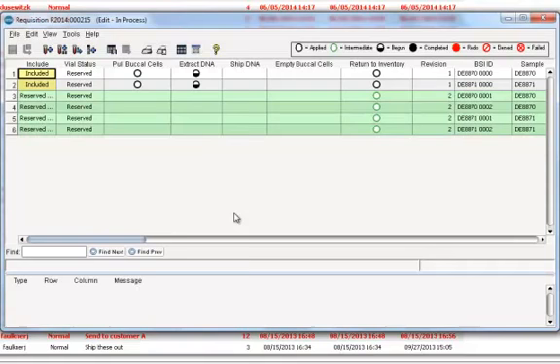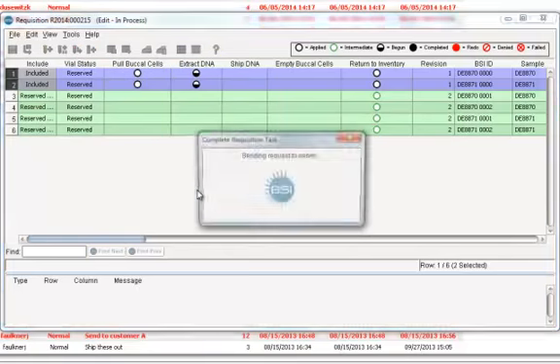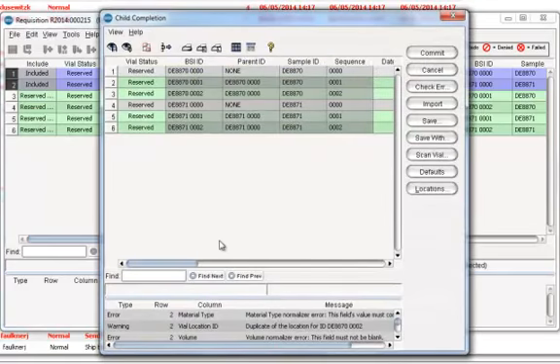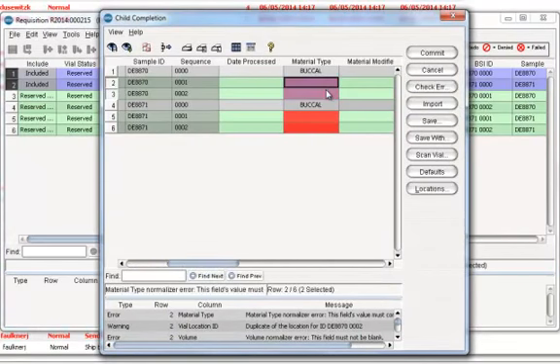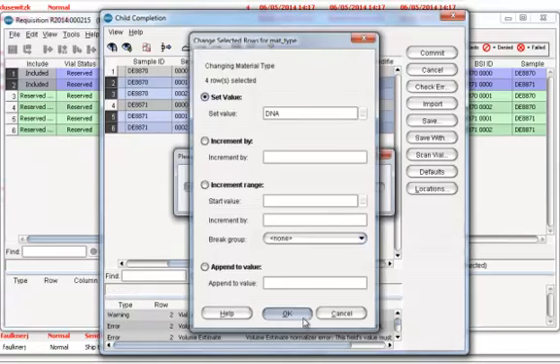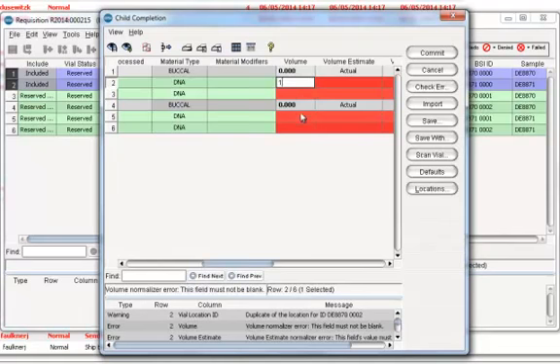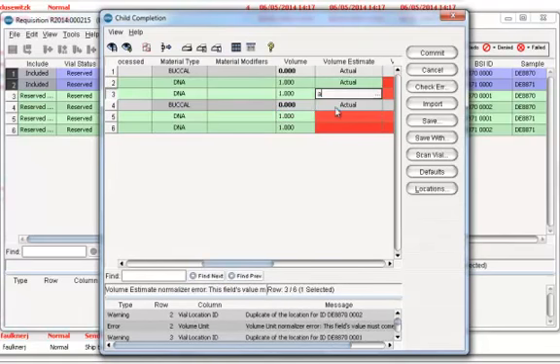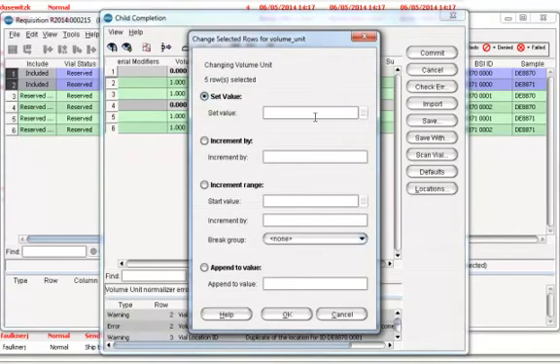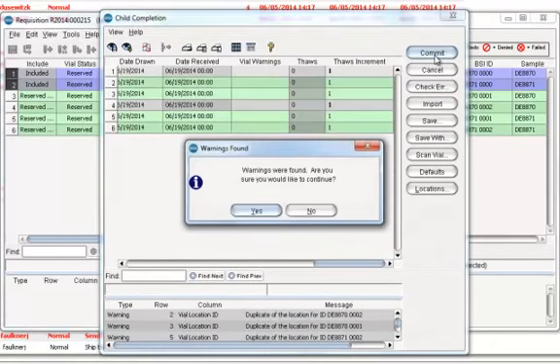I'm going to skip generating reports, adding task data, and scanning to complete tasks. Task statuses will change as the specimen data changes.